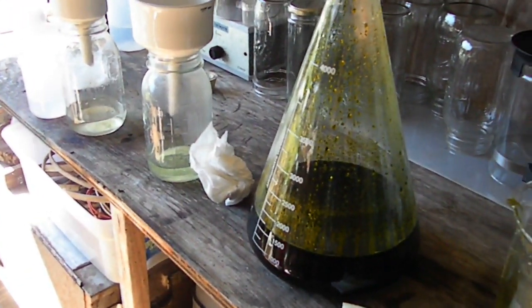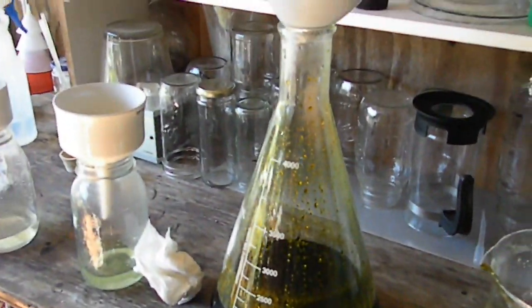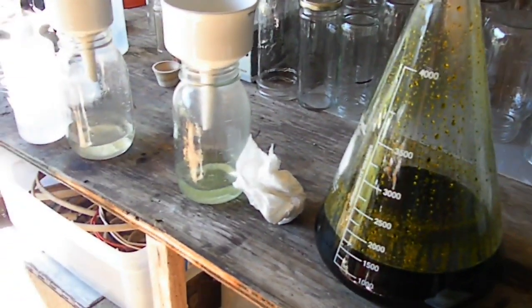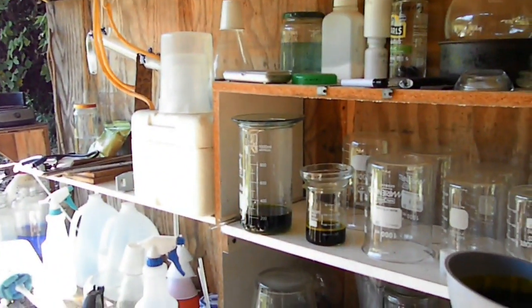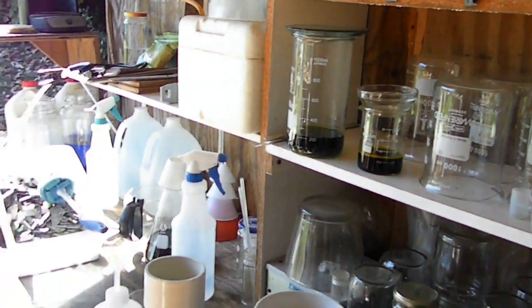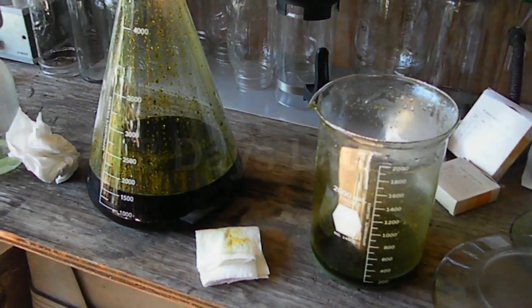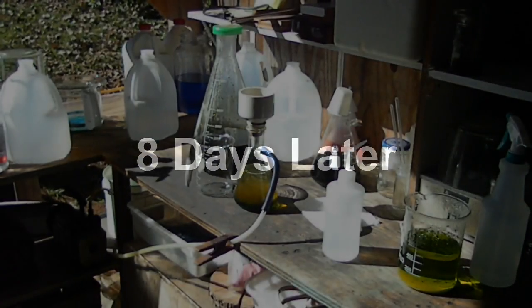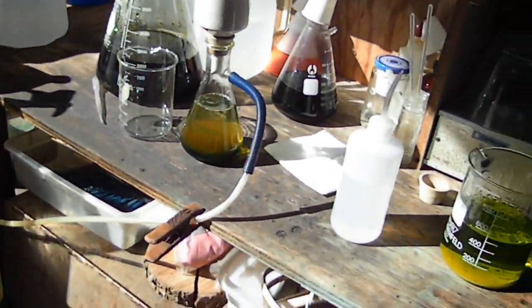As soon as we get this filtered off we'll move up into the next stage, which will be filtering it again and cleaning up that little bit of stuff from the backs and from the first acid rinse. I just wanted to tell you where we are and that we will get back at you in a bit. Okay everybody, we are back out in the lab finally.